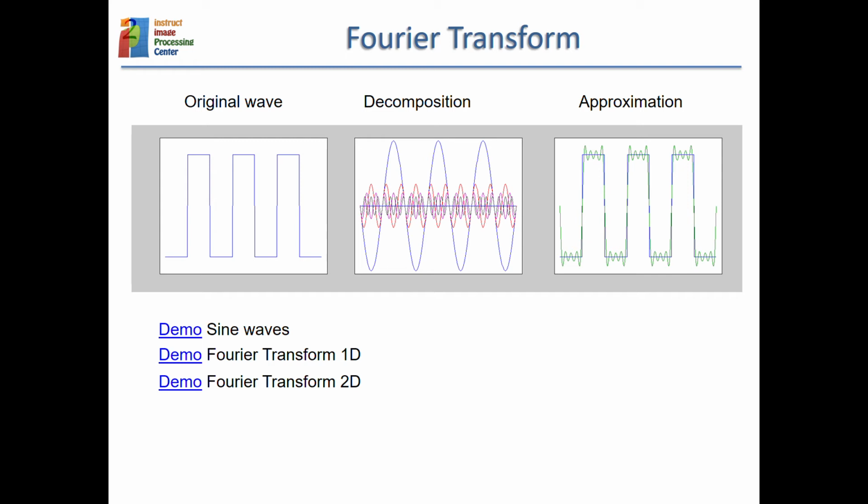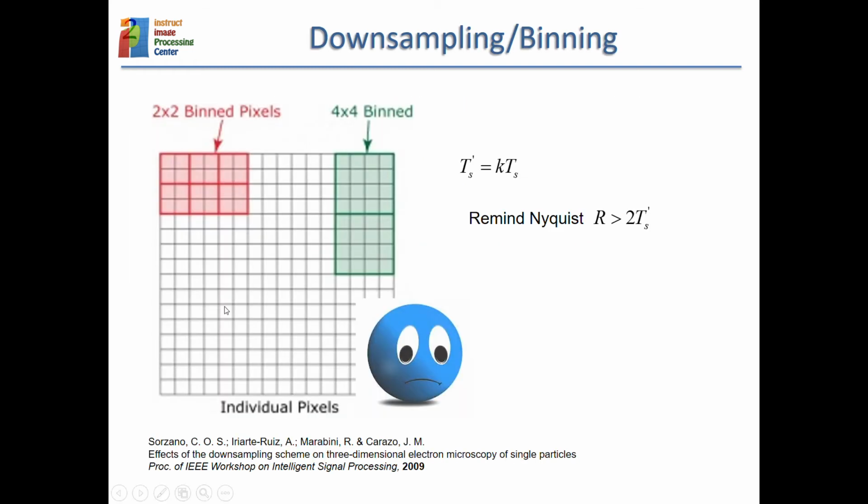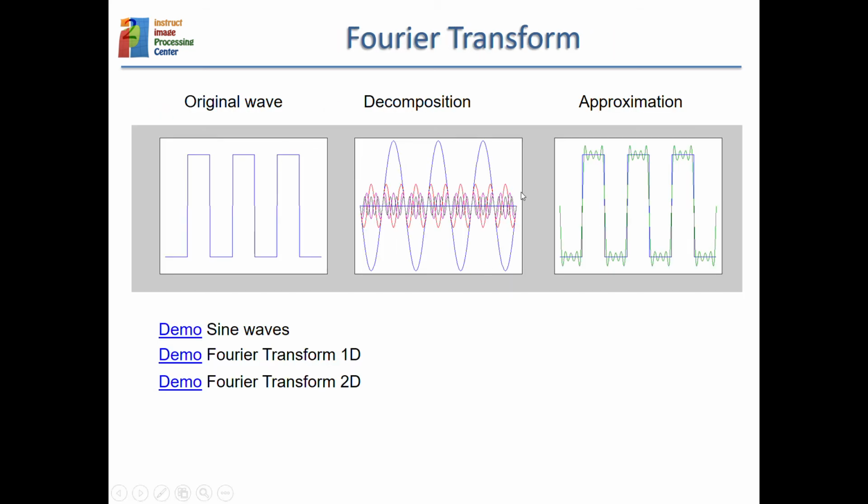The way we interpret images, you can think of these images as having... you can decompose this image as an image with just one pixel, the top left pixel, and then the second pixel, another image with just one pixel, and another image with just one pixel. All these images with just one pixel are called delta functions. So instead of being the addition of many delta functions, you can think of an image as being the sum of waves. And this is very nicely illustrated in one dimension.